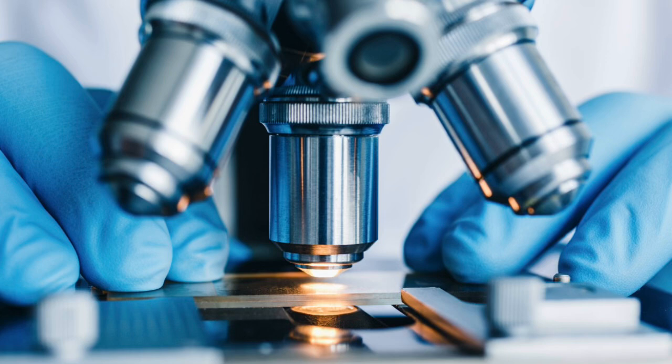Microscopes play a role in many real scientific investigations. For example, if a single hair is found at a crime scene, forensic scientists can examine its color, structure, and measure a pattern under a microscope. While hair analysis alone cannot positively identify a person, it can help narrow down suspects or exclude individuals.